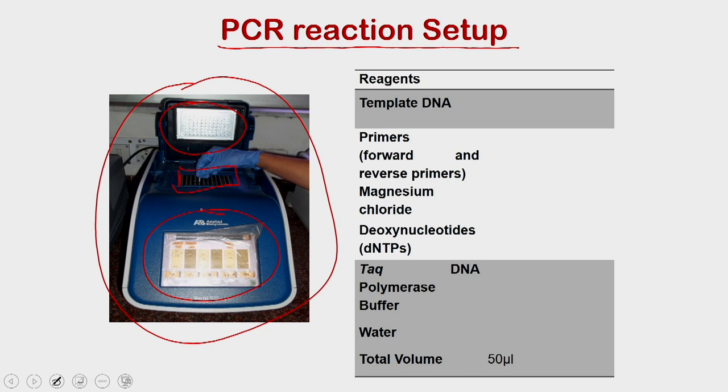Apart from that, the students will also show you how to set up the PCR reactions. So the purpose of these videos or the demo is to show you how to perform these experiments.